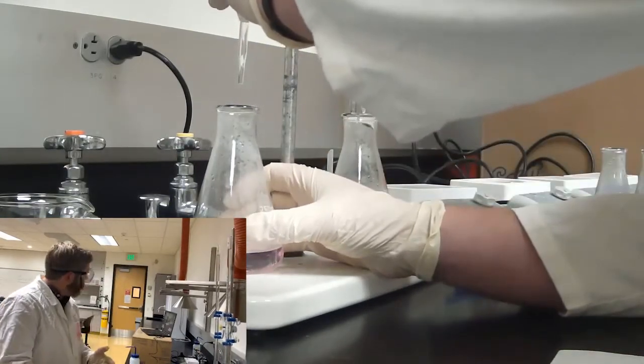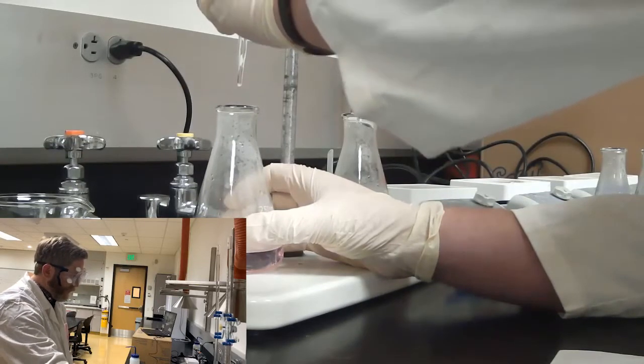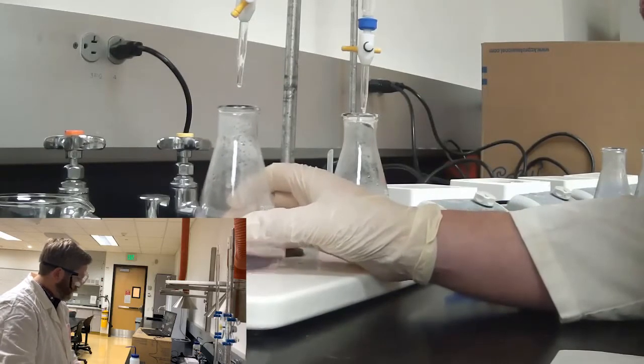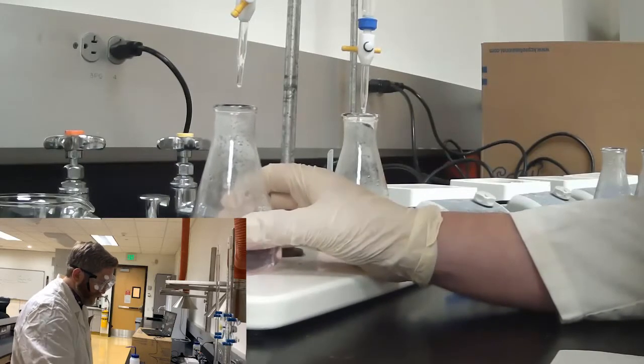All right, as we can see from our Erlenmeyer flasks here for our sodium bicarbonate, they have proceeded to boil, and they have not changed to the yellow color, so we are good to proceed. I carefully remove them from the heat and allow them to cool.